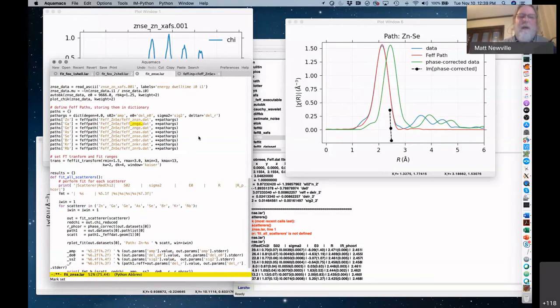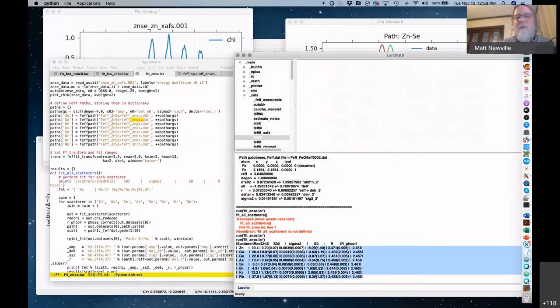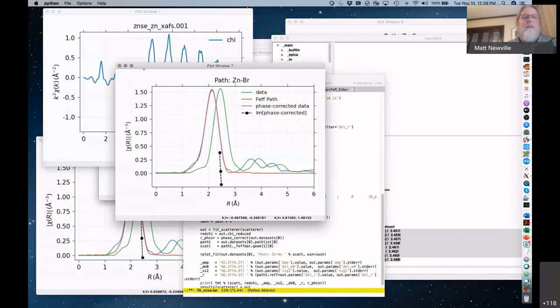So there's possibilities for other features. In fact, E0 is different because the potentials are different for each of those, or E0 refined differently, actually in a systematic way. So that's also maybe something worth looking into as you do your analyses with these tools. So I hope that inspires more questions than I could possibly answer, and a lot of plots of different data. So yeah.